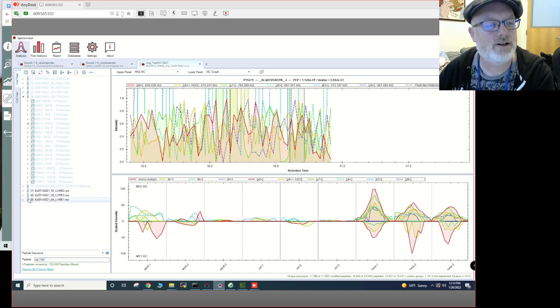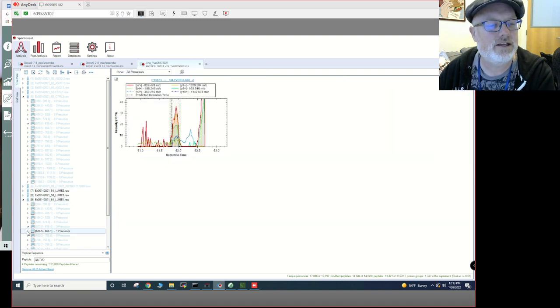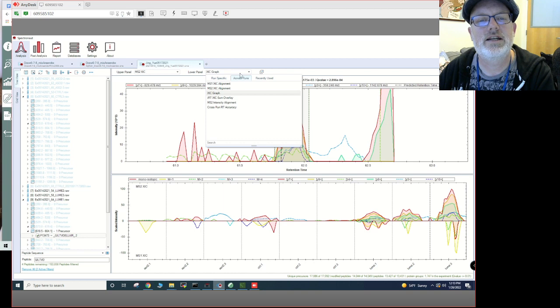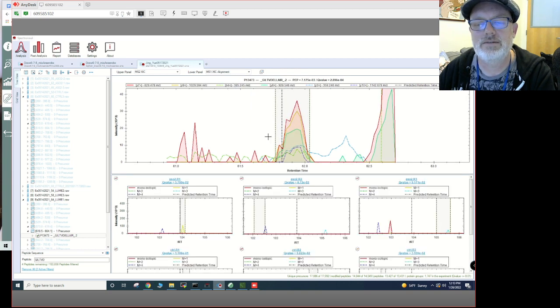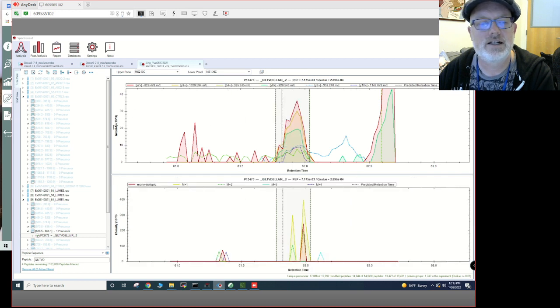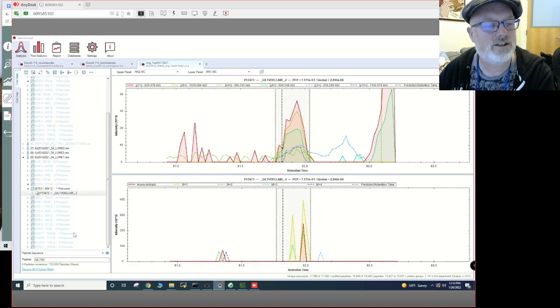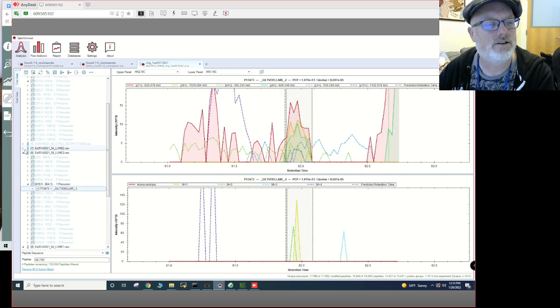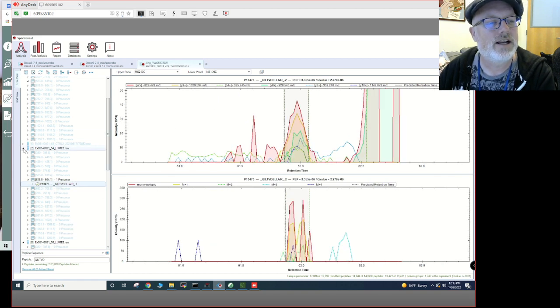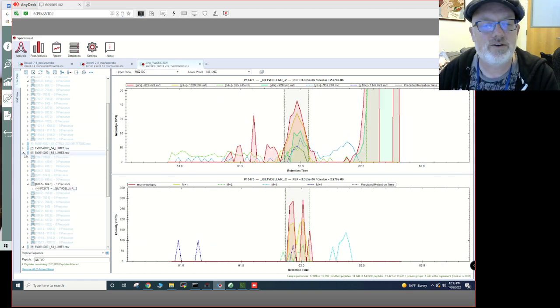They only show up in our LUME samples. I must have screwed it up the first time somehow. Okay, and we want to look at this. Looks good. We could do the MS2 and MS1 on the bottom. Oops, where is it? MS1 run specific, MS1. You can see we don't have very good evidence for the MS1, but the MS2 is strong. And it all lines up. So I'm pretty confident.